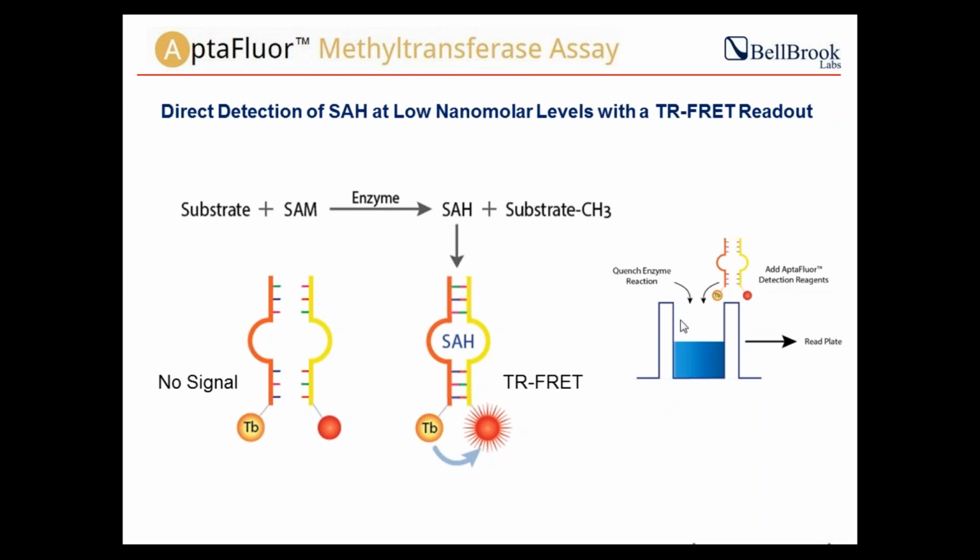You also have the ability to run it in kinetic mode if you're running the assay using peptide as your substrate. You do not need to quench. The assay requires that you quench if you're running it with histone proteins and nucleosomes.